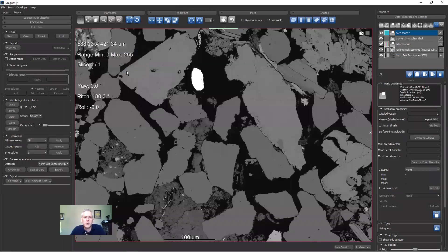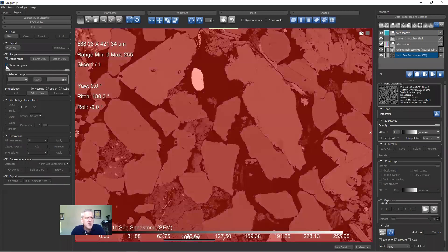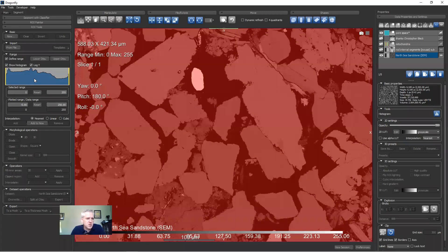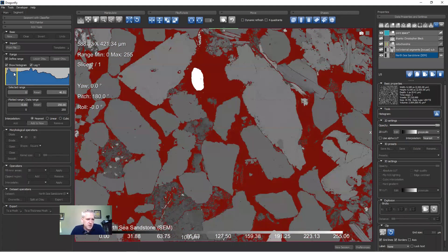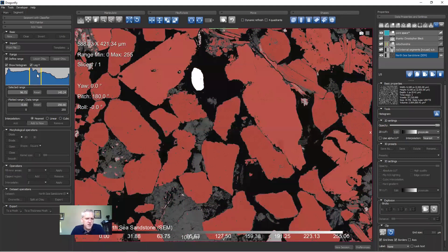Let's say I'm interested in labeling the pore space — I give it a name and select a color, maybe something that looks like epoxy under an optical microscope. So I now have a region of interest called pore space. On the ROI Tools panel we could start with Thresholding, done with the Range panel. I'll make sure the North Sea Sandstone is selected, click Define Range, and click Show Histogram. This is the image intensity histogram for the North Sea Sandstone. I could drag this until I had just the pore space highlighted.